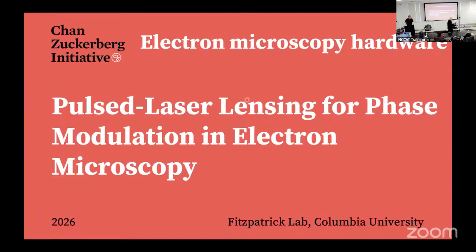Okay. Thank you very much, Ed, and thank you all for being here. This is going to go fairly slowly. I only have 20 slides, but I thought that we could talk a little bit about microscopy as a whole, electron microscopy in particular. Have all of you been on a Krios before? Do you feel like you understand how it works? No. So it's very similar to a light microscope.